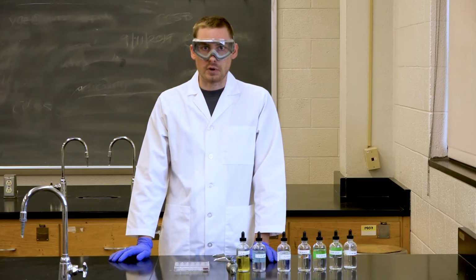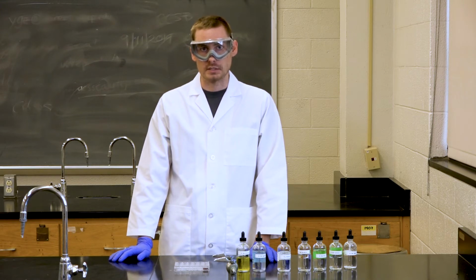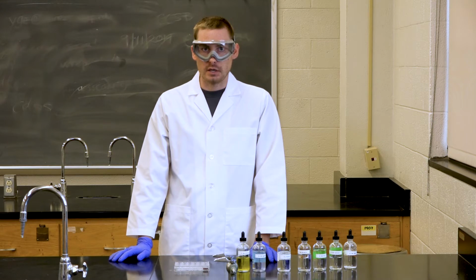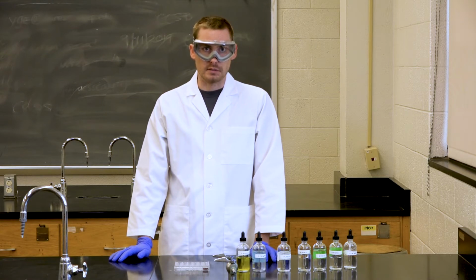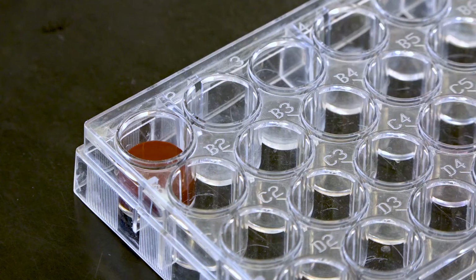Combining these 4 ions, silver, nitrate, potassium, and chromate, we can come up with 2 new compounds, either potassium nitrate or silver chromate. We know from our solubility rules that any group 1A element is soluble in water. That's every element in the first column of the periodic table. So this cannot possibly be potassium nitrate. Likewise, any compound that contains nitrate is always soluble in water. So this compound that has formed must be silver chromate.